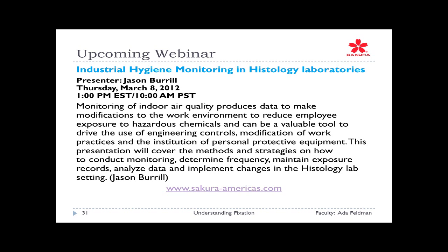I mentioned them because they were supporting the required amount of time for NBF, and they were using times, showing you the longer times that we don't use in clinical histology anymore, of 24, 48 hours. That was just supportive documentation that NBF needs time, and it's much more time than we're really using in histology these days.